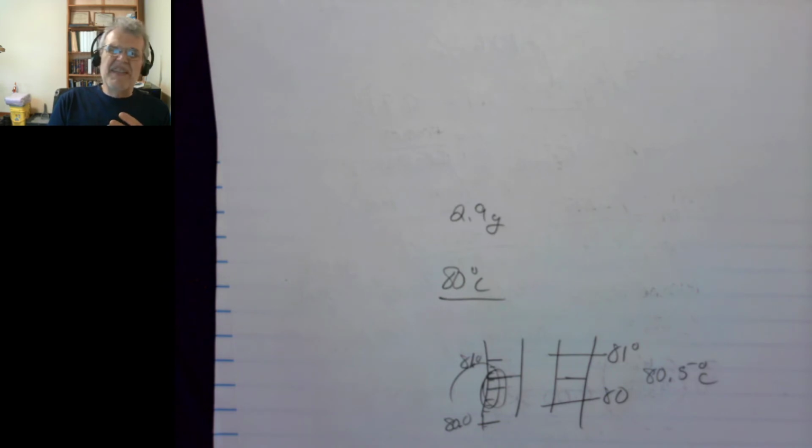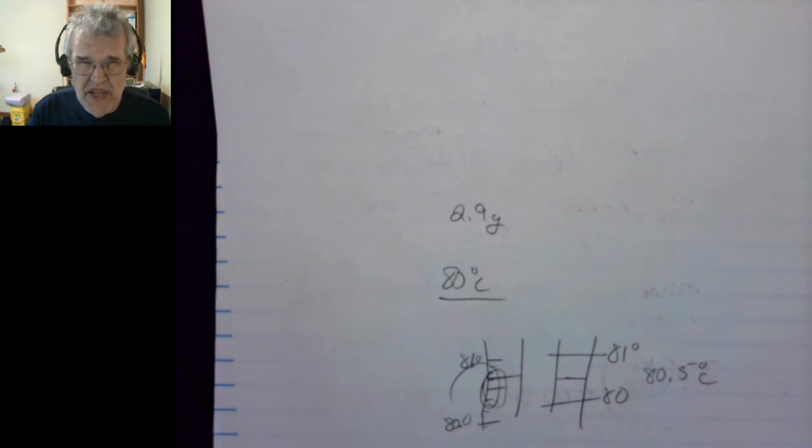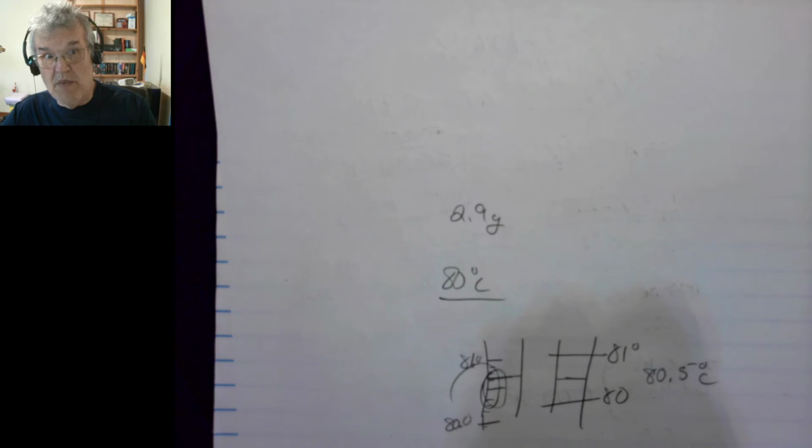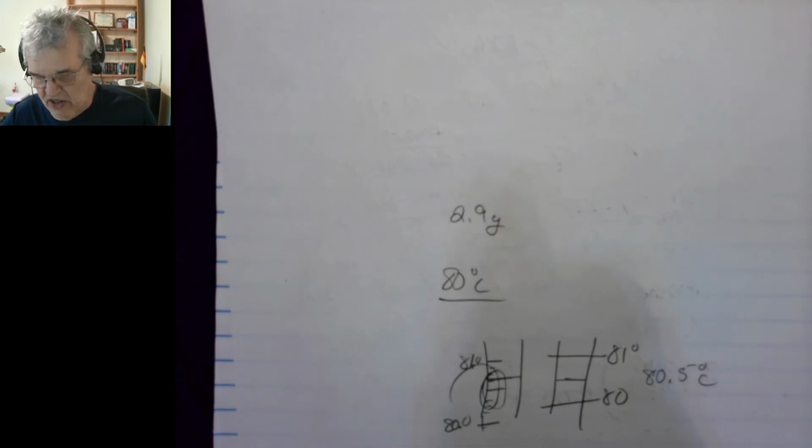It has to be exactly the same. Be really, really careful doing these readings. Don't do it really loosey-goosey. It won't take very long. And you'll notice that as it's getting cooled down like that, it's going to start crystallizing. You're going to see crystals forming inside there as you stir it around, and it starts crystallizing. So you put that data in your data sheet.